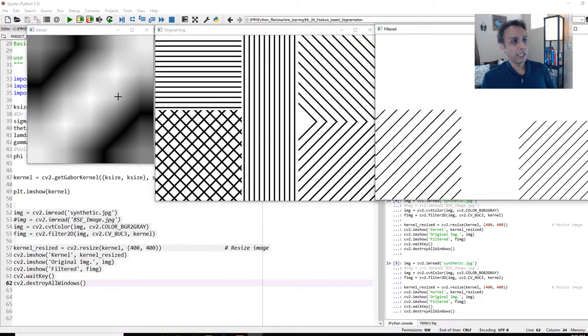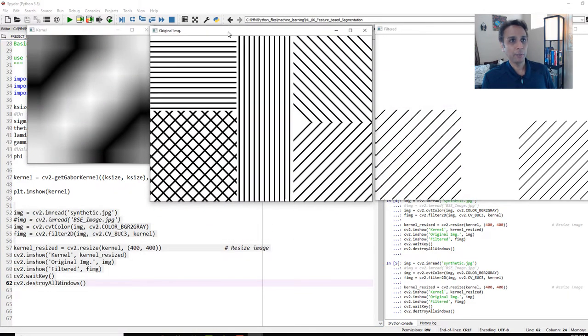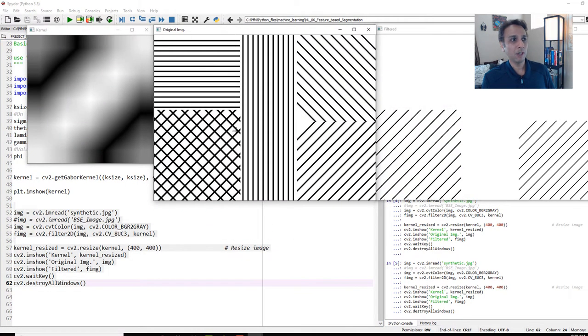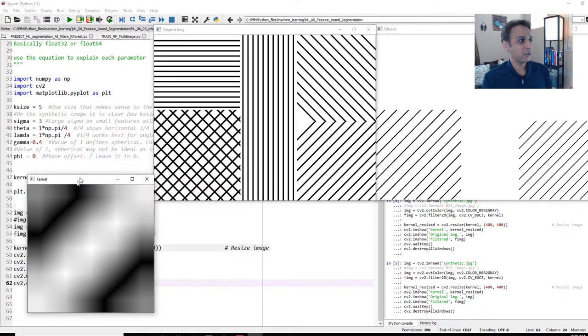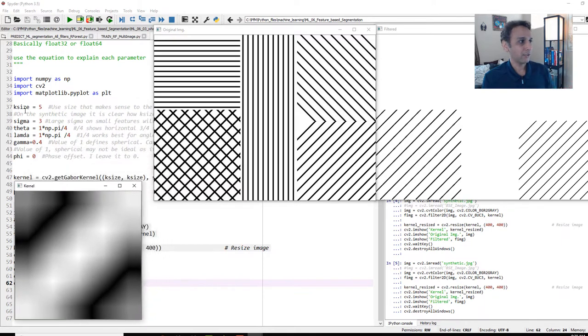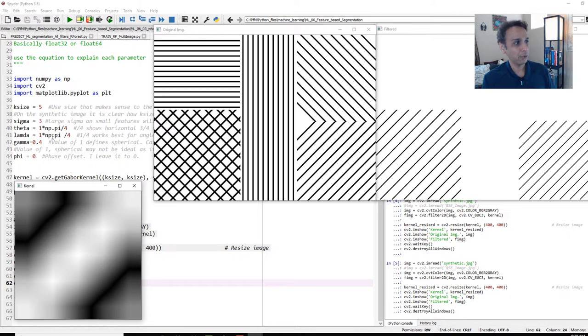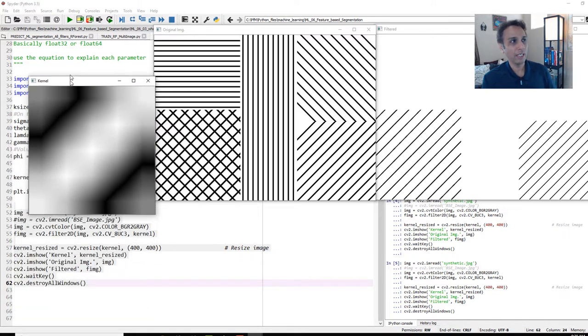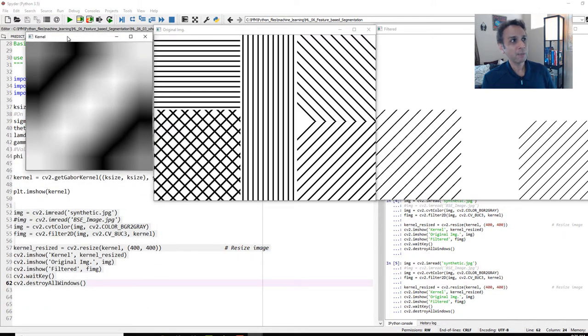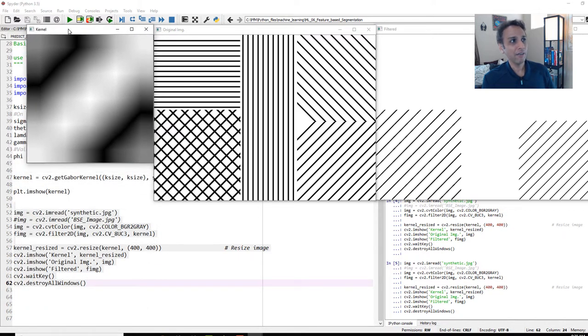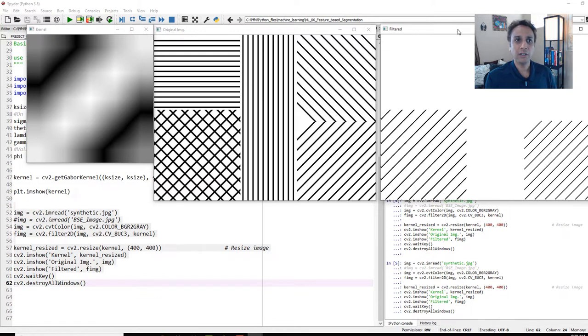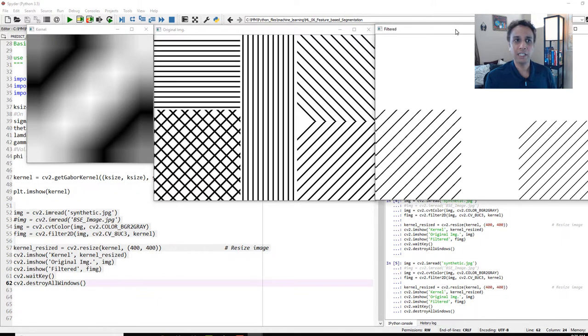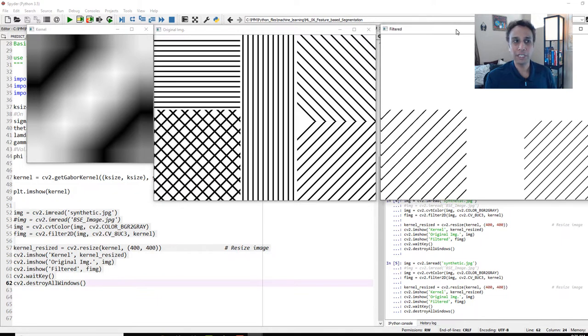Here is the input image right here. This is my input image with all these lines, and I did that for a reason. And on the left-hand side is the kernel that got generated using these features, with a kernel size of 5, sigma 3, theta equals to pi over 4, and lambda is pi over 4, gamma 0.4. With that specific values, this is the filter. And when this gets applied onto the image, this is the response right here on the right-hand side. This is the filtered image.